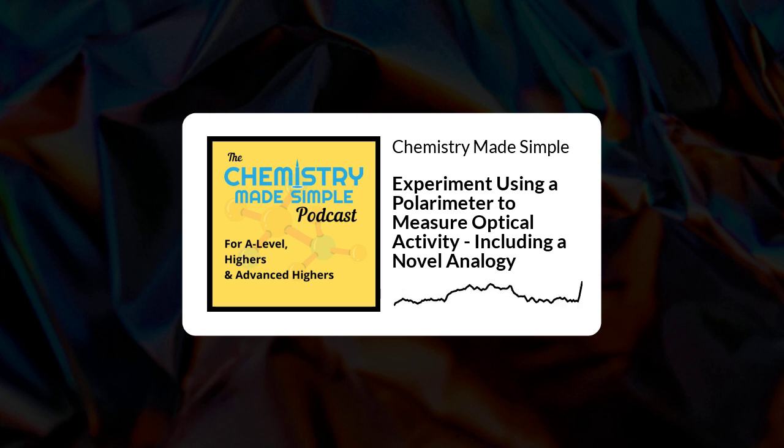I wanted to use this episode to follow up on the episode about optical activity and the plane polarized light experiment. So I want to talk through an analogy today to try and represent the parts of the experiment, as it's not necessarily something that's easy to understand when listening to just the audio version of it. So we're talking about the experiment that uses plane polarized light to see whether a sample has optical activity or not. And if you remember from the previous episode, the enantiomers, the individual isomers of an optically active compound, exhibit optical activity. They are able to turn the plane of plane polarized light from its starting plane to a different plane.